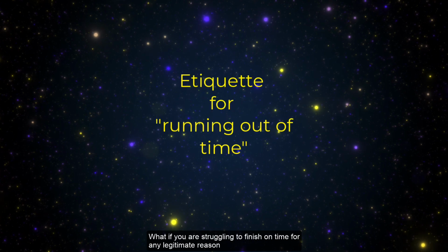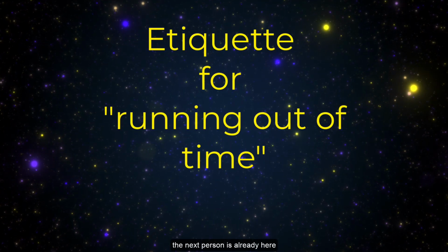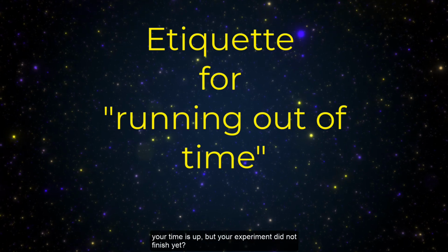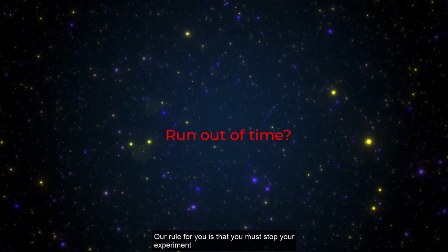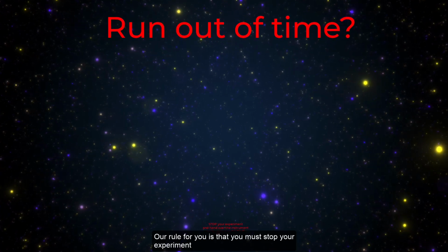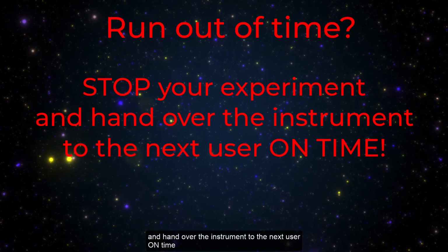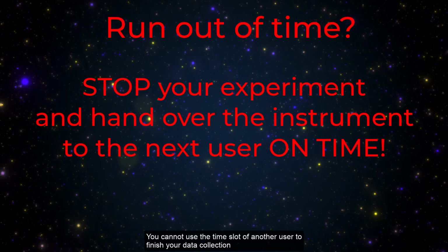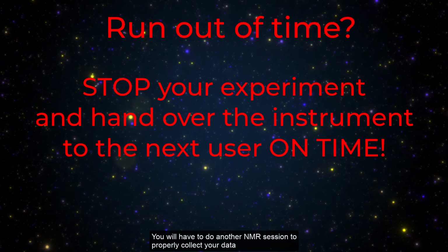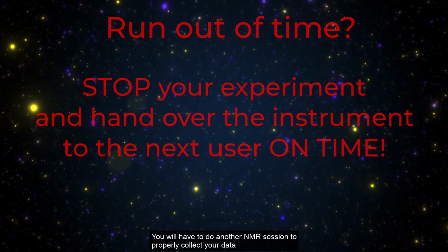What if you are struggling to finish on time for any legitimate reason? The next person is already here. Your time is up, but your experiment didn't finish yet. Our rule for you is that you must stop your experiment and hand over the instrument to the next user on time. You cannot use the time slot of another user to finish your data collection. You will have to do another NMR session to properly collect your data.